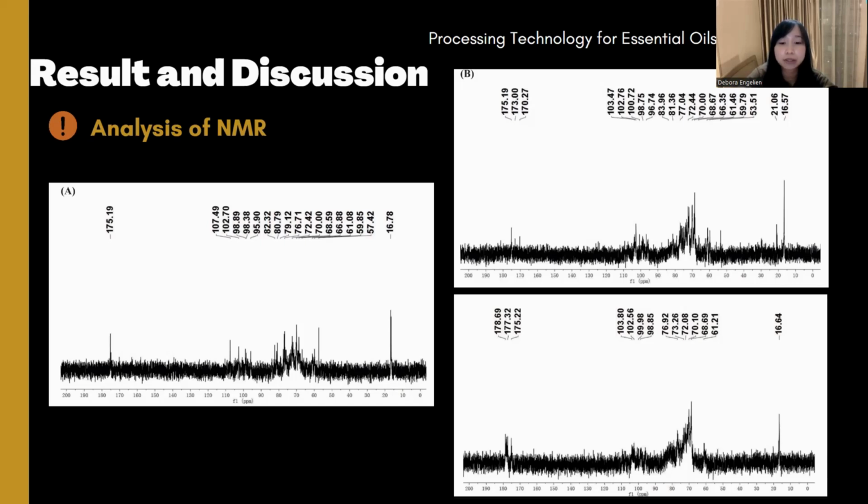This is reasonable in terms of chemical structure because the C6 carbon has a smaller rigidity and larger spatial extent than carbon at other positions. And of course, the chemical shift of the signals in the range of 65 to 90 ppm also suggested that chemical modification occurred at other sites at the same time. In conclusion, the NMR analysis once again demonstrated that the two chemical modifications were successful.